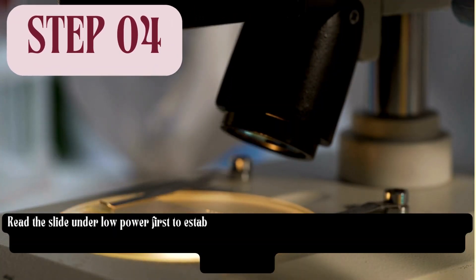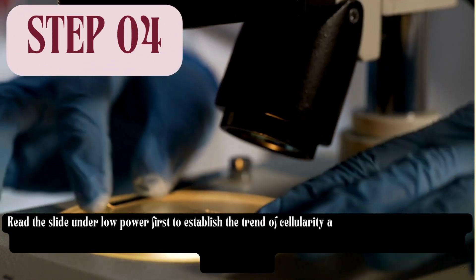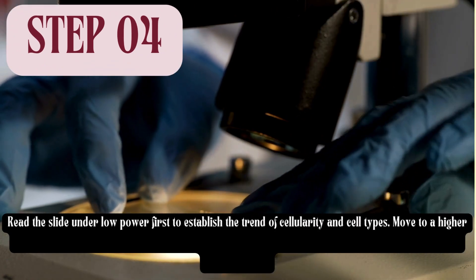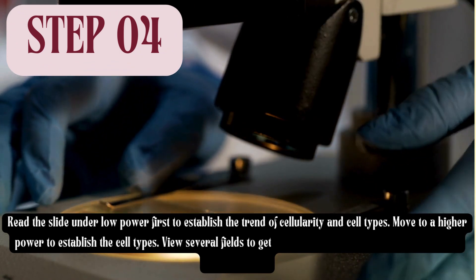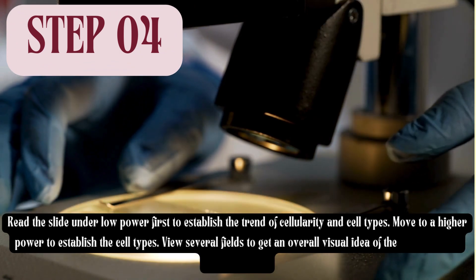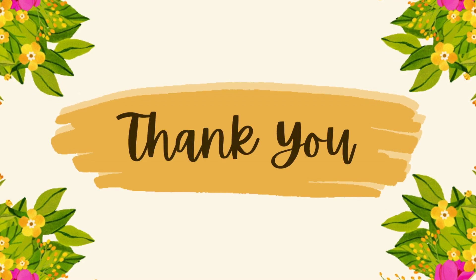Step 4: Read the slide under low power first to establish the trend of cellularity and cell types. Move to a higher power to establish the cell types. View several fields to get an overall visual idea of the percentage of cornified cells.